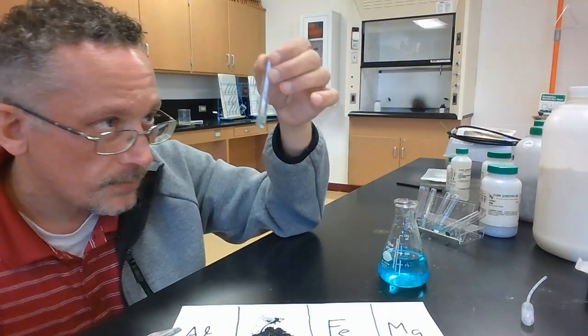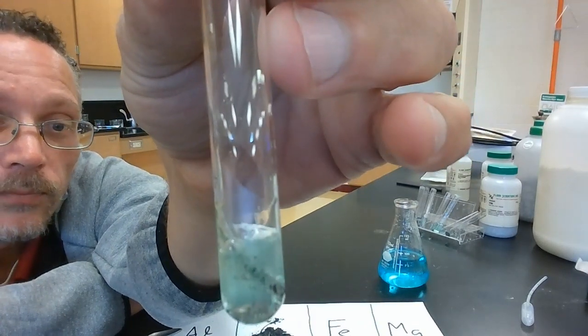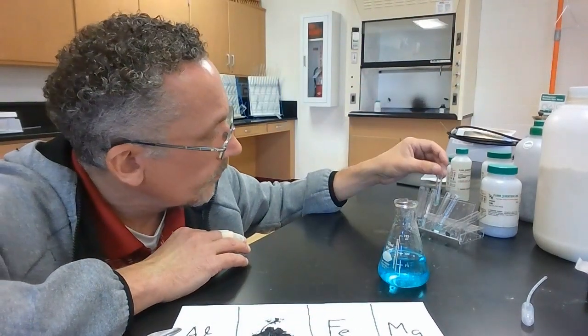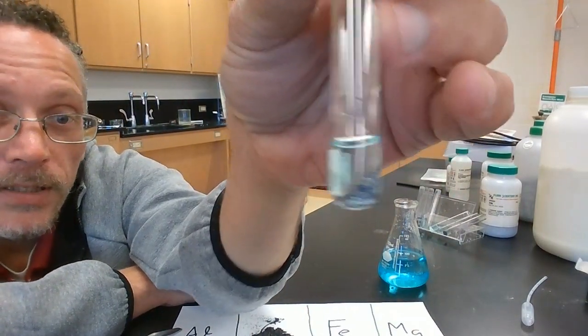The magnesium is definitely reacting. There's bubbles being formed, you can see the color changing. I can hear little bubbles popping in there, some little fizzing. Let's see, silicon, I don't see anything happening with silicon just yet.